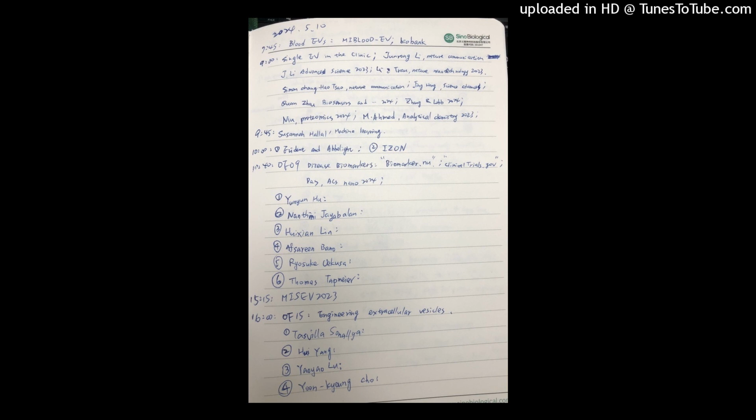So we then tried to do the SEC separation after the ultracentrifugation, so different fractions here. You have vesicle numbers and protein amount. And here again, the idea that you have a few big proteins that are very common and you have to get rid of them. I think you're all familiar with the difficulties of this sort of thing. And I've blotted for syntenin in fraction 3, the vesicle fraction, and fraction 10 is the protein fraction, and you can see that syntenin shows up nicely in these dilutions. So we're currently trying to find out how low we can get with the dilution to still get a signal for syntenin, and then we'll try the markers again.